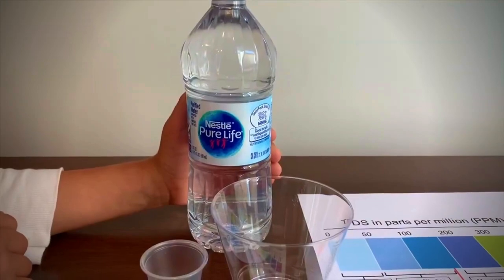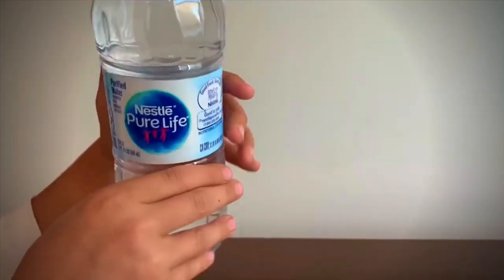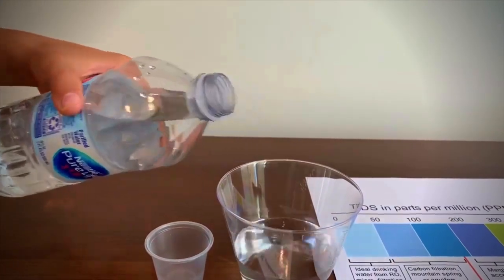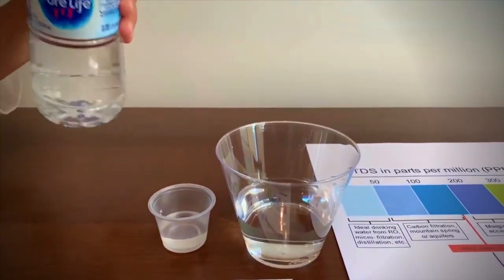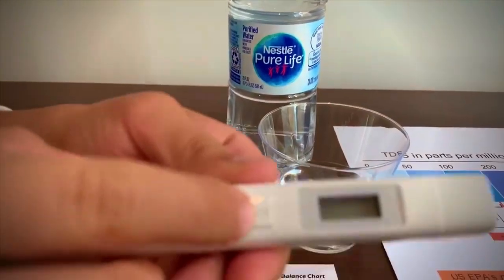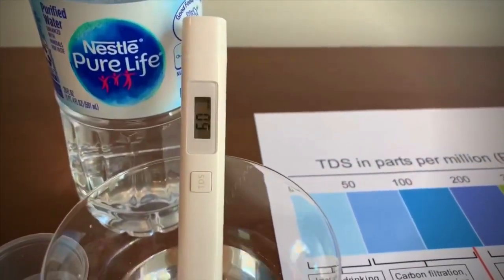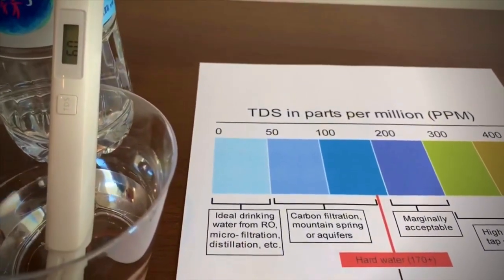This is the Pure Life purified water. It has four minerals for taste and it costs one dollar. First we're going to test the TDS, then we're going to test the pH. Turn on the TDS tester, make sure it says zero. It is 60 — that means it's okay to drink.